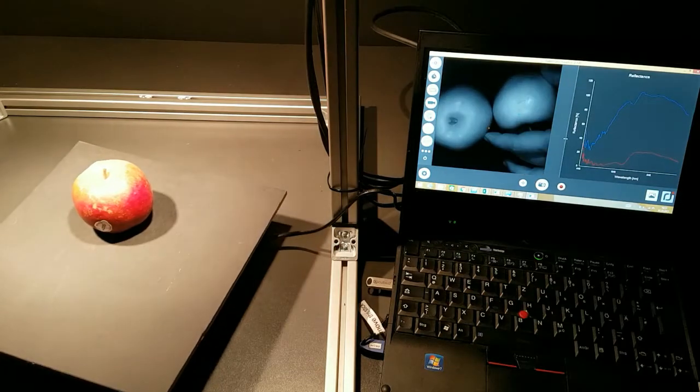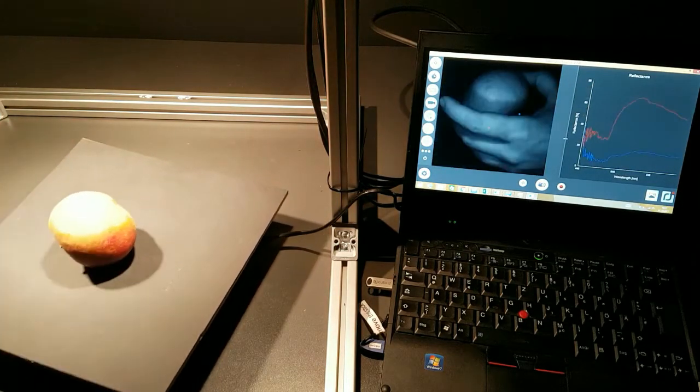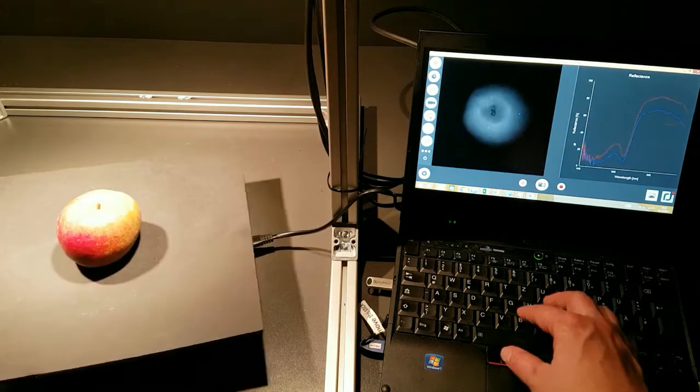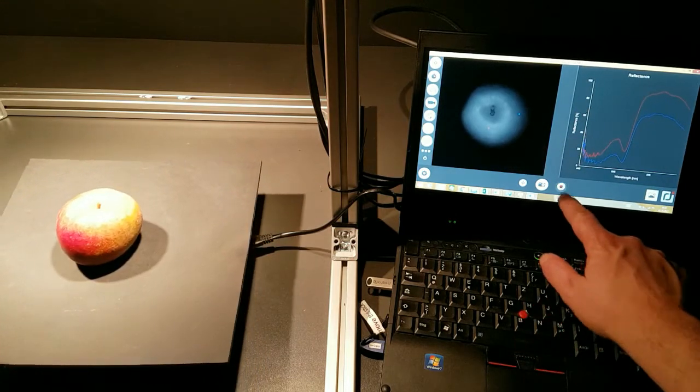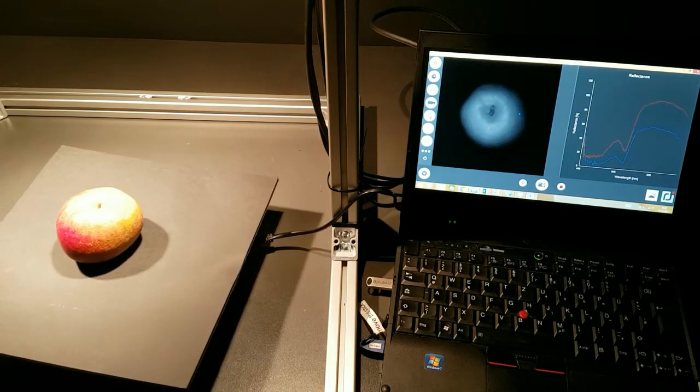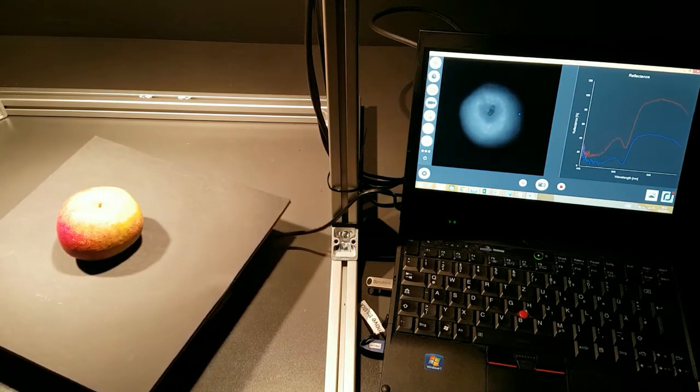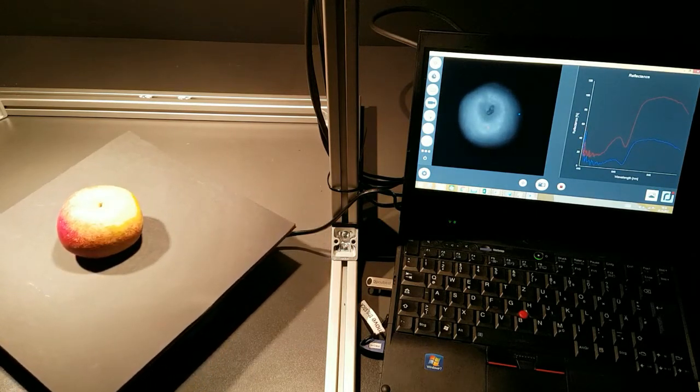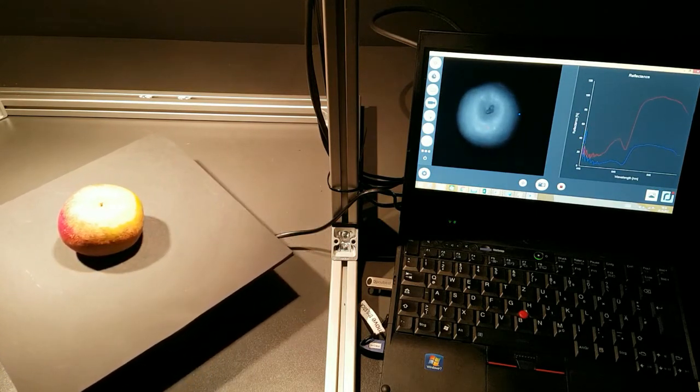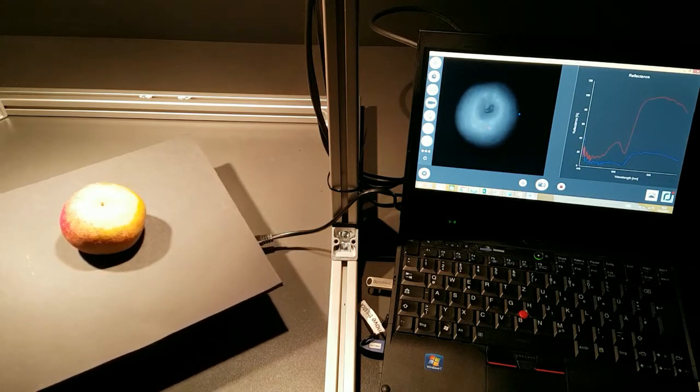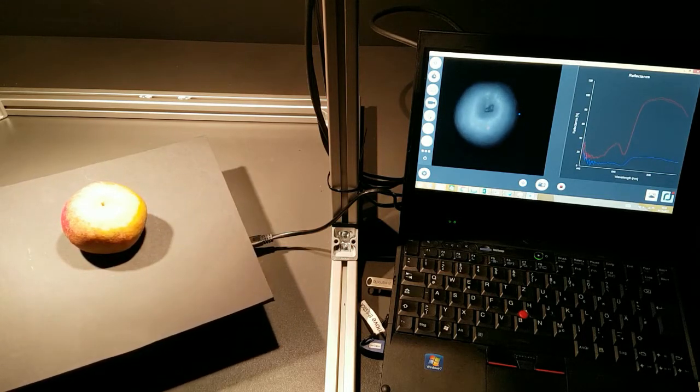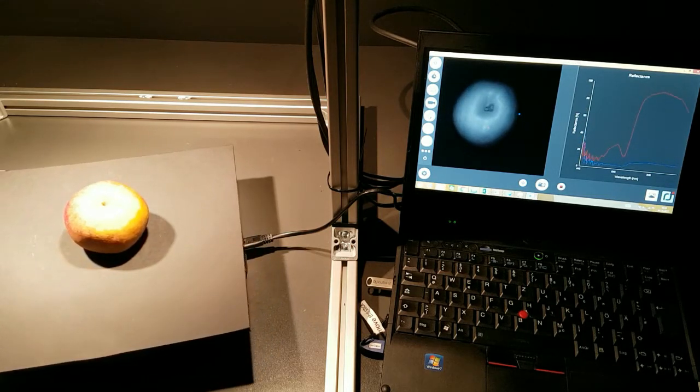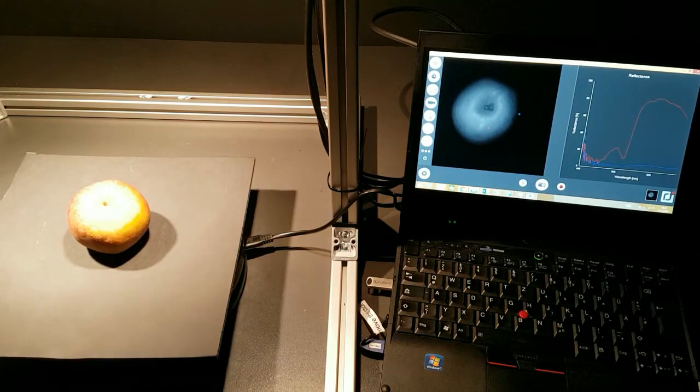The only thing you have to do is you put one apple in the middle and in the software you just start a video. You wait for a few seconds. The software now records spectral images of the apple while it is moving and rotating. And then you can stop that.